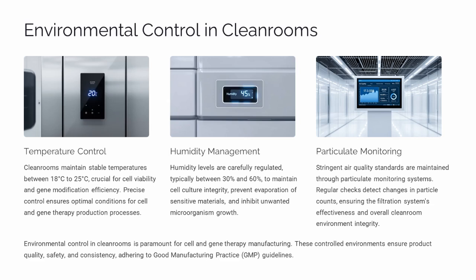Environmental control in cleanrooms is crucial for cell and gene therapy manufacturing. This includes temperature control, humidity management, and particulate monitoring. These controls ensure optimal conditions for production.